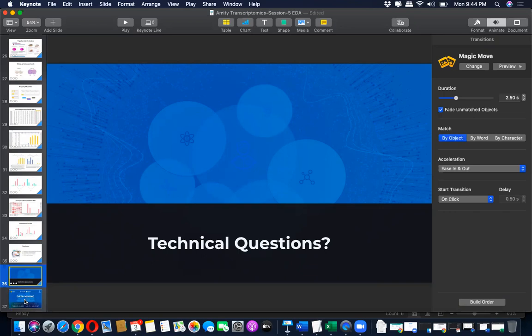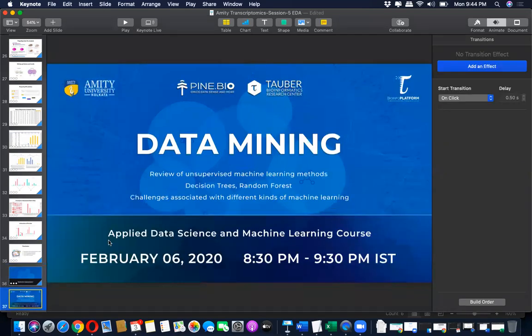So in the next class, we will be doing machine learning, and we will be talking about how this data is next used for machine learning, and how this data is applicable to machine learning. And we will also learn about another data set. We did this mouse PDX model.